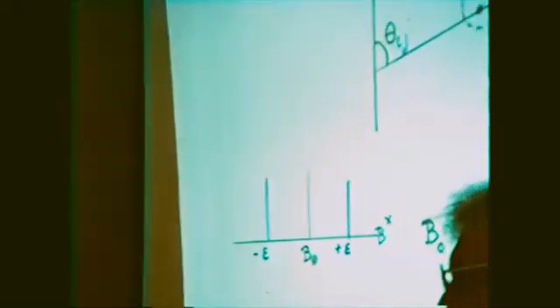And so we decided to use dipole interaction. I remind you that if you want to use dipole interaction, you must be sure that you have really a rigid lattice. So you must work at very low temperature, the base being, of course, 4 Kelvin.